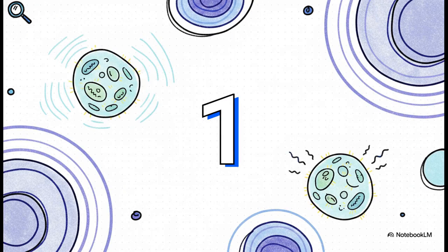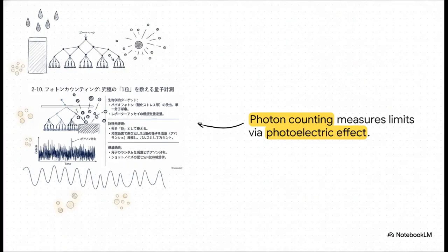But what happens when you want to measure the ultimate biological limit, down to just a single isolated event? Like, what if you are looking for the absolute faintest possible whisper of a cell under oxidative stress? Well, that brings us to System D, Photon Counting.